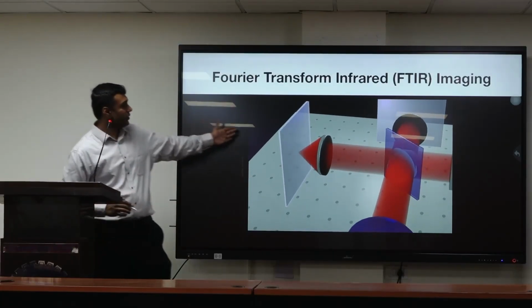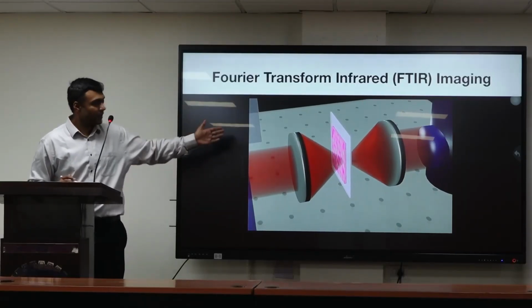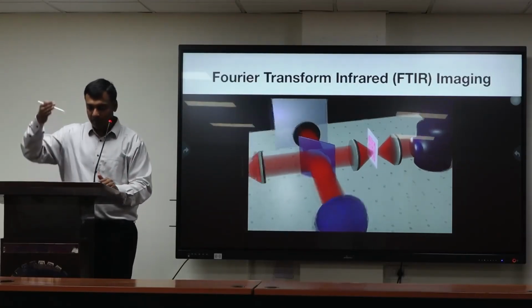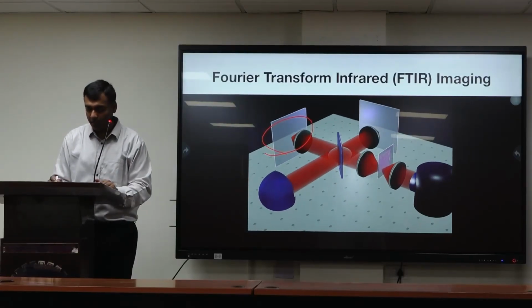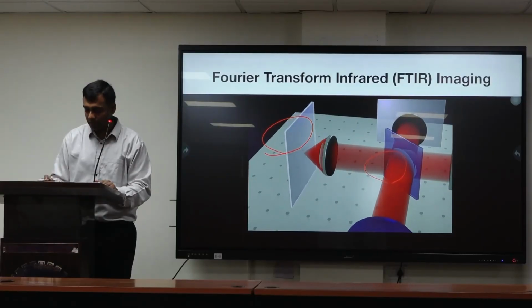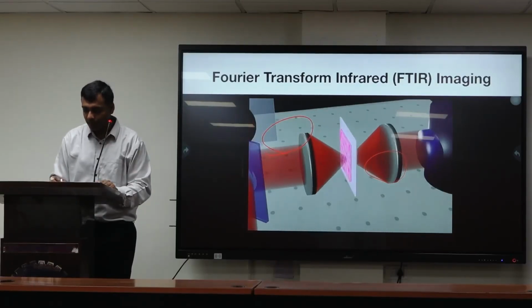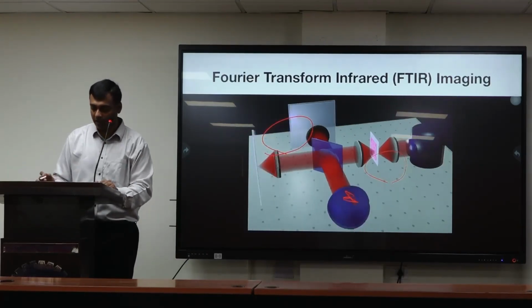You're moving one mirror, and you're also moving the sample on a stage, with XY movement, and for every image you get this data.